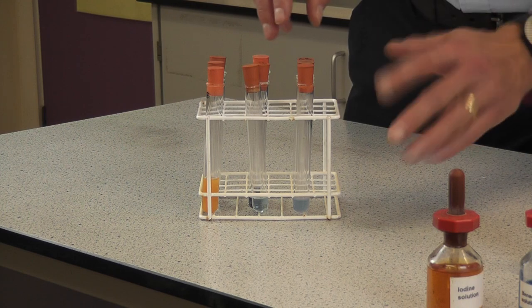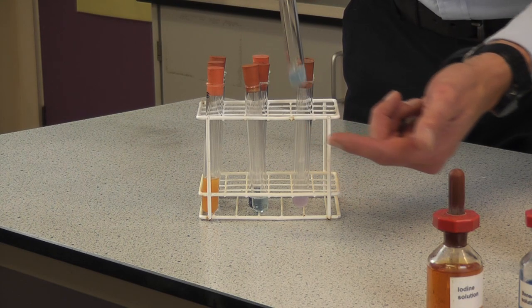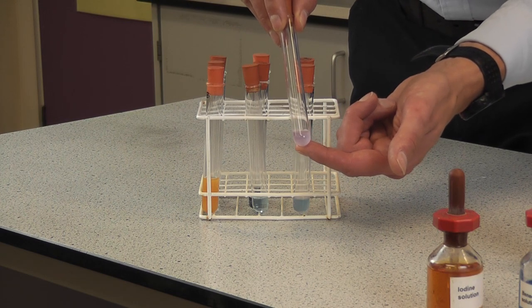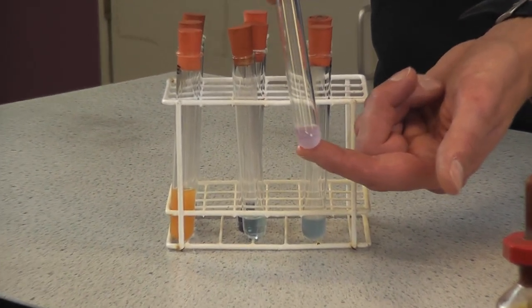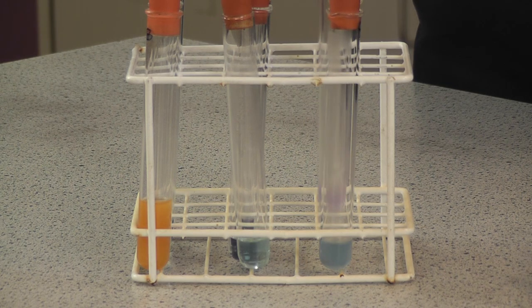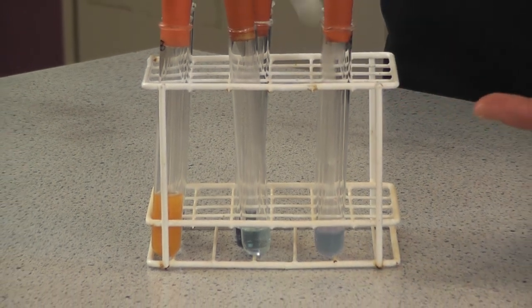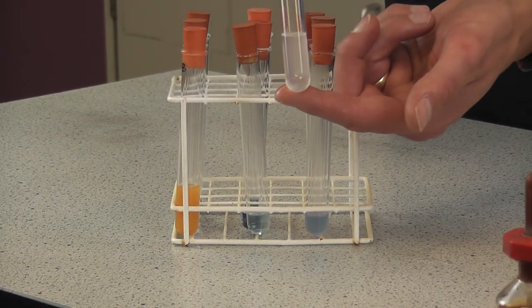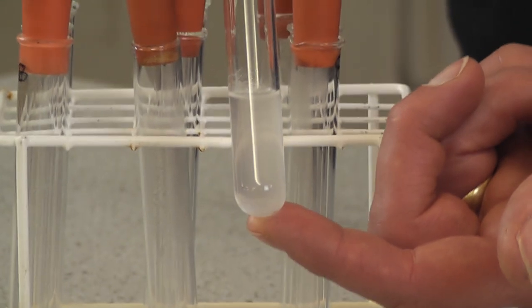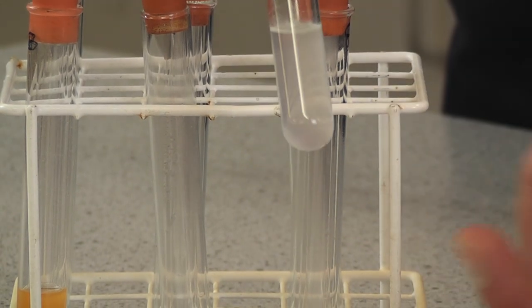Finally, the cheese results. With cheese we've got a negative test for glucose — the solution remains blue. But this is where we see a positive test for the Biuret solution — the first positive protein test we've seen — with that lilac, light purple colour, exactly what we'd expect for cheese. Negative result for starch, and we do have a slight emulsion for the lipid test with the ethanol, which we'd expect for cheese.